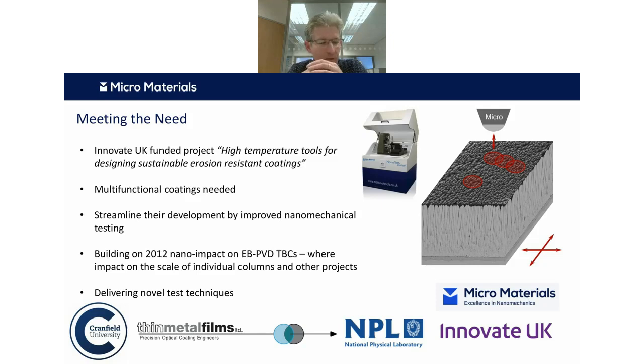So we set up, with Cranfield University, Thin Metal Films and the National Physical Laboratory, an Innovate UK funded project called High Temperature Tools for Designing Sustainable Erosion Resistant Coatings. I'm going to be talking today about some of the work that we've done within that project, and it builds on a previous study with Cranfield University where we've shown how we can use our nanoscale impact test technique to look at these thermal barrier coatings.